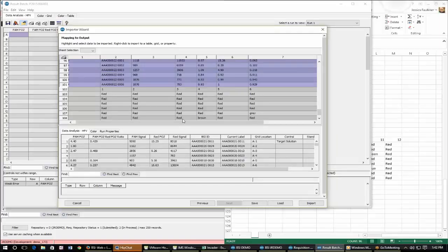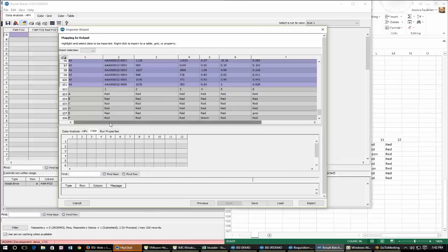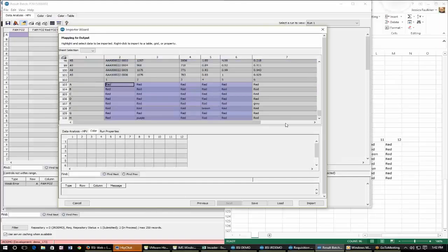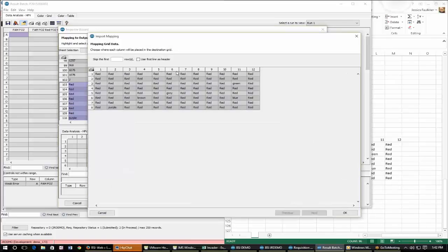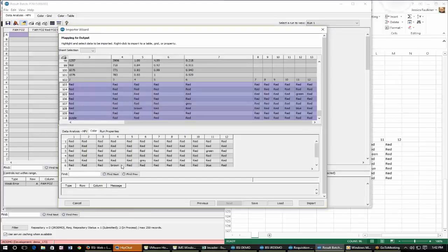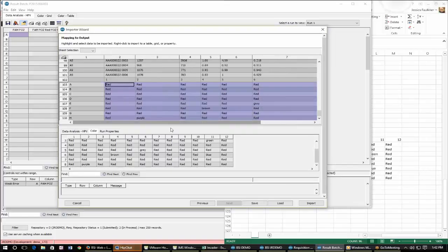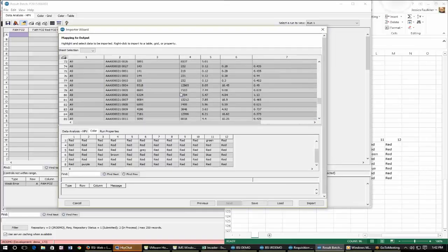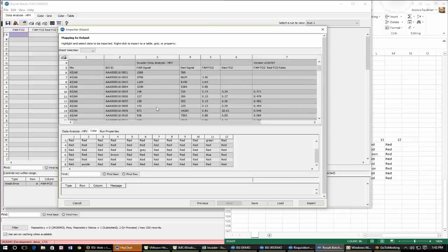Okay, so then for my color grid, I can select this and import my grid, and everything's fine here, so just import, and that's all set at the bottom. So that was with all of this flexibility for how you can import things. It takes a little bit more time if you're importing multiple tables worth of data and different properties.